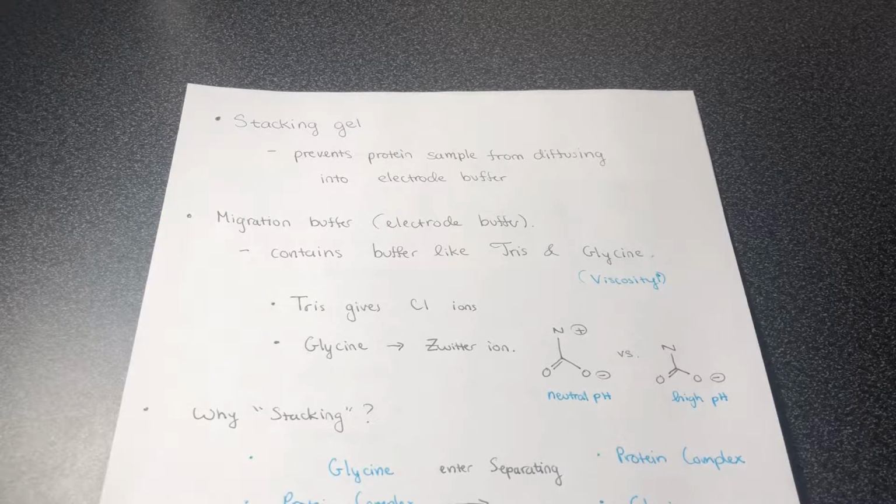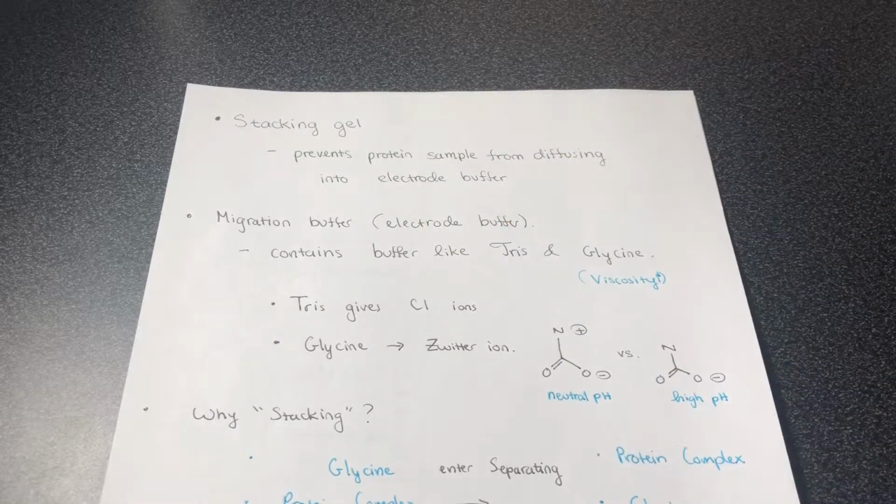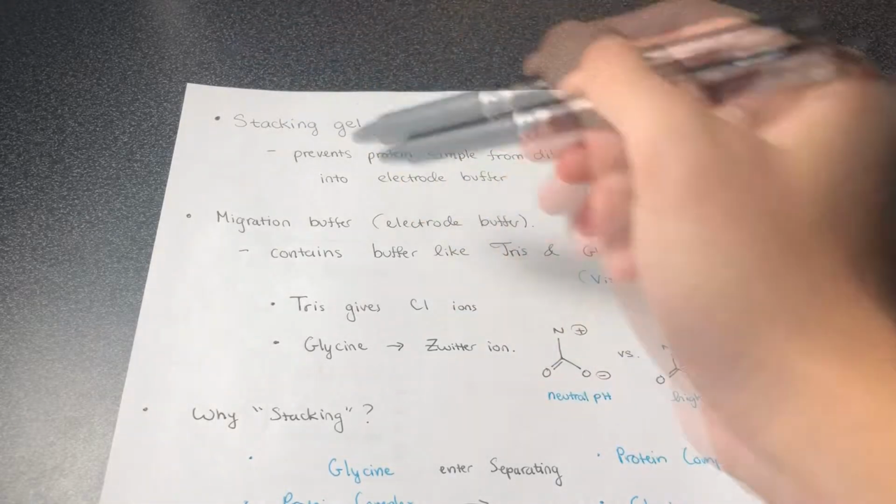This is great because imagine you have proteins of different sizes and you have different things in there. They're going to flow at different speeds. So if you have a protein at the top, you don't want it to start all the way at the top. You want it to start at the same position. The lower pH allows it to go to the bottom of the well. Then you have what I referred to as the electrode buffer, but it's the migration buffer.